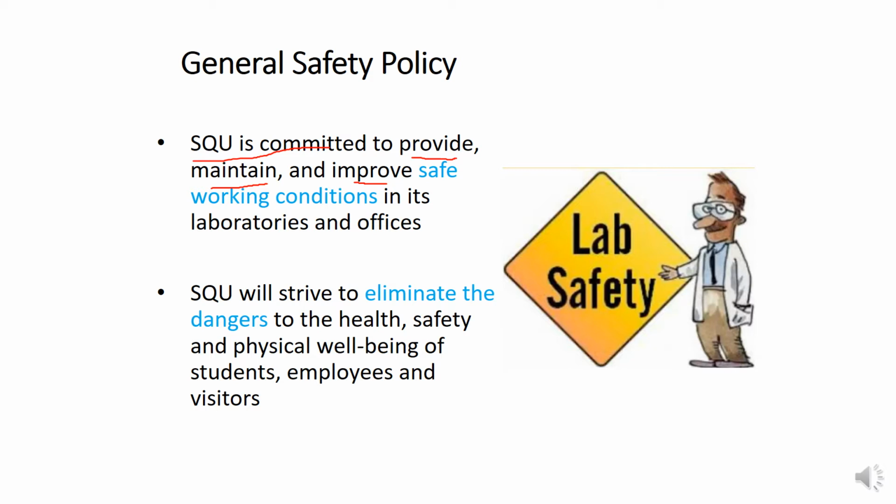How do they improve? We will discuss in one of the lectures the material data sheet and how the feedback goes to the office of SQU, the RMO. RMO is the Risk Management Office. It is one of the departments, you can see a small organization within SQU, that handles all the safety measures at SQU. Their function is to provide, maintain and improve the working conditions in the labs at SQU.